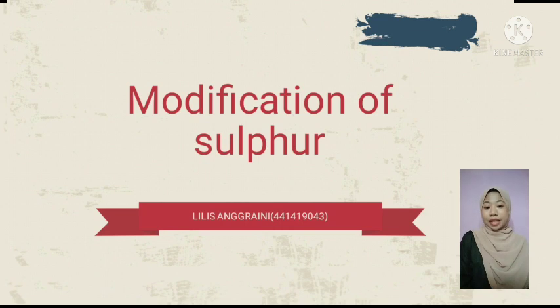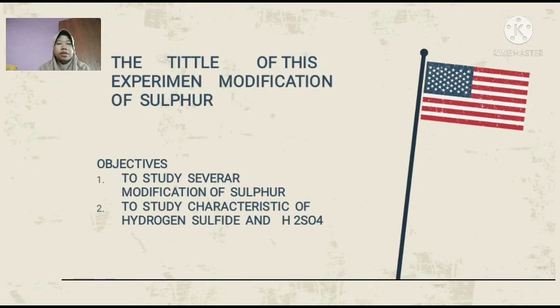My name is Lilis Anggraini from Class A Chemical Education. In this video, I will present our practicum in organic chemistry. The title of this experiment is Modification of Sulfur. Objective: first, to study several modifications of sulfur. Second, to study the characteristics of hydrogen sulfide and sulfuric acid.